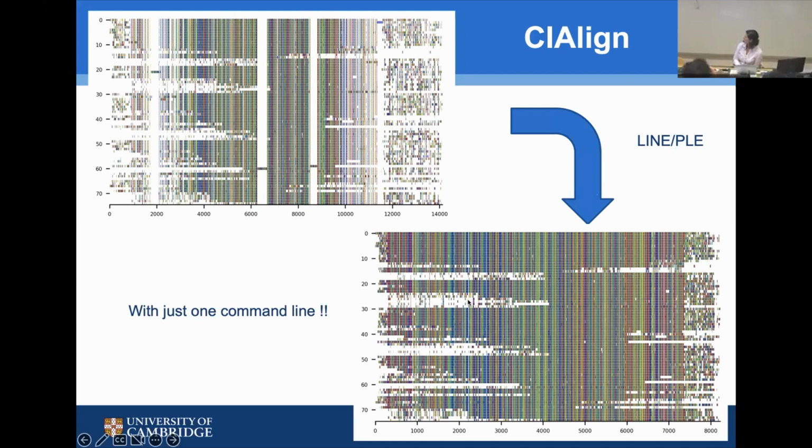And as you can see, of course, ideally you want to look at it and order them from longer to shorter, and you will see that sort of inverse triangle. But if you look carefully, that is already there. A lot of them are full length, some of them are a bit smaller. But that consensus is going to look pretty good.